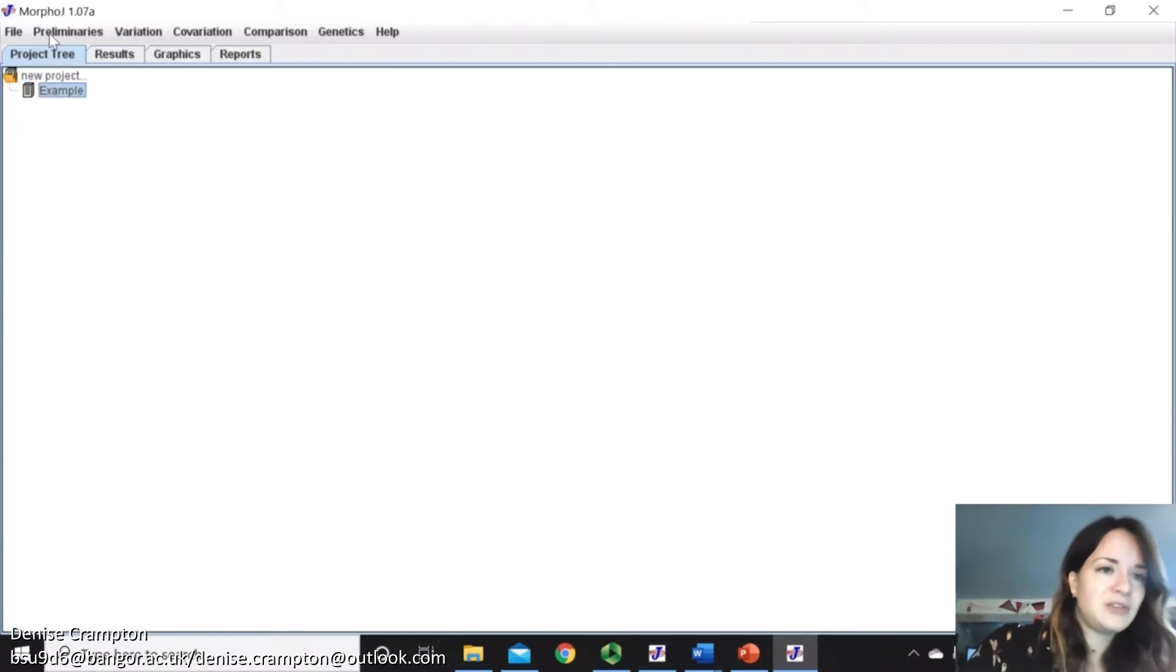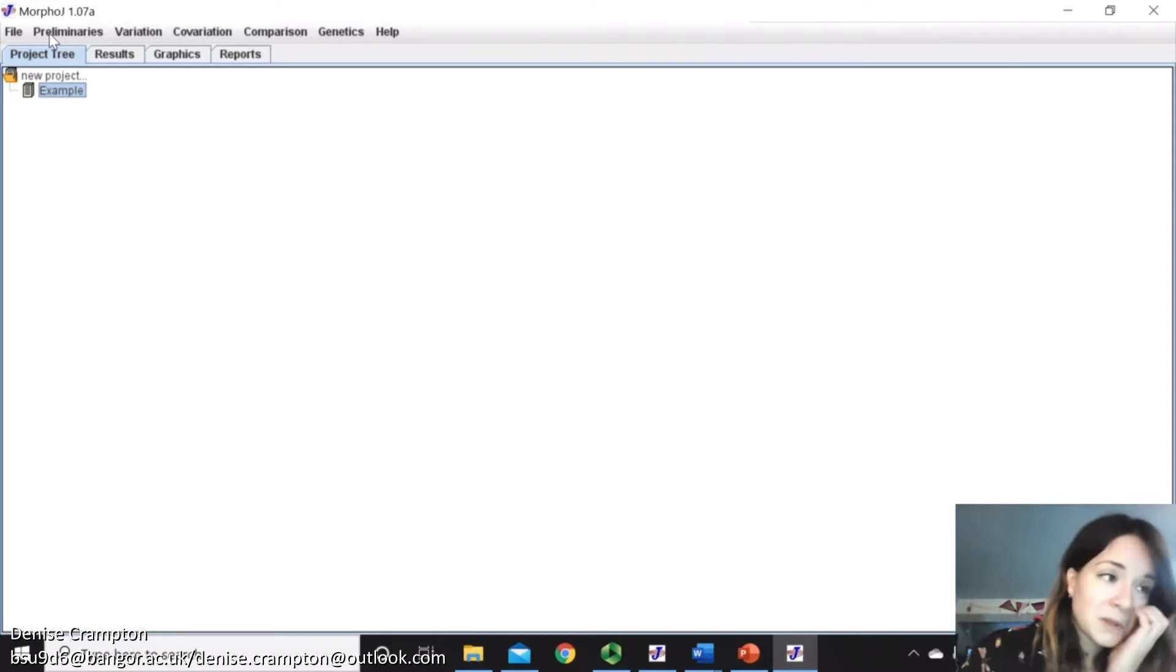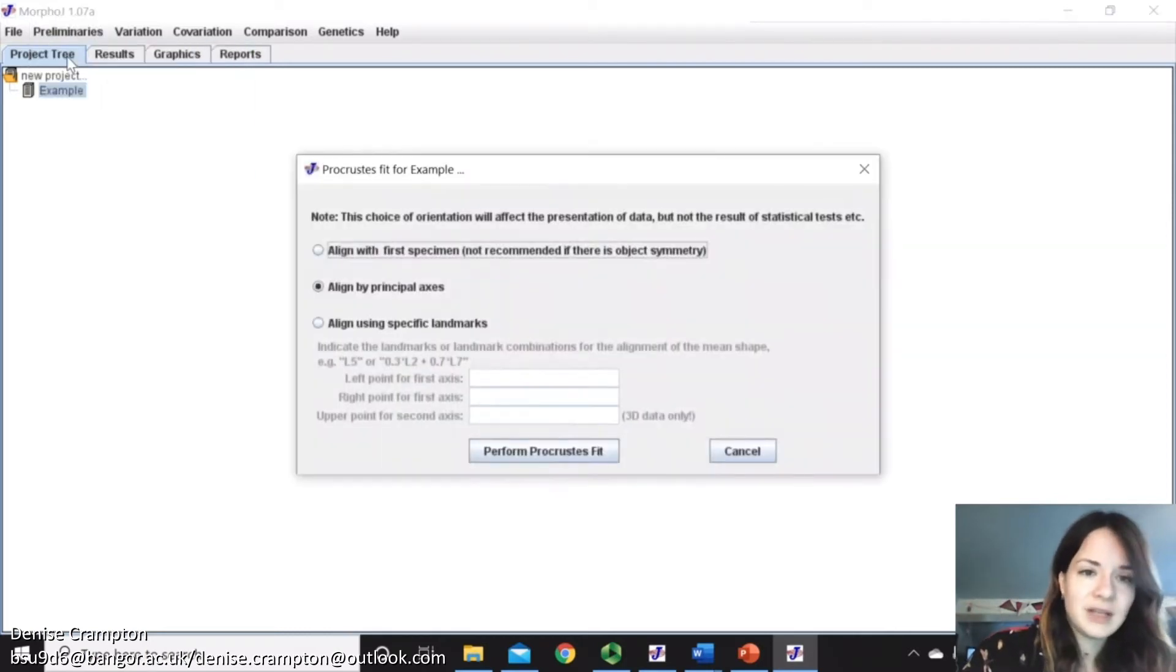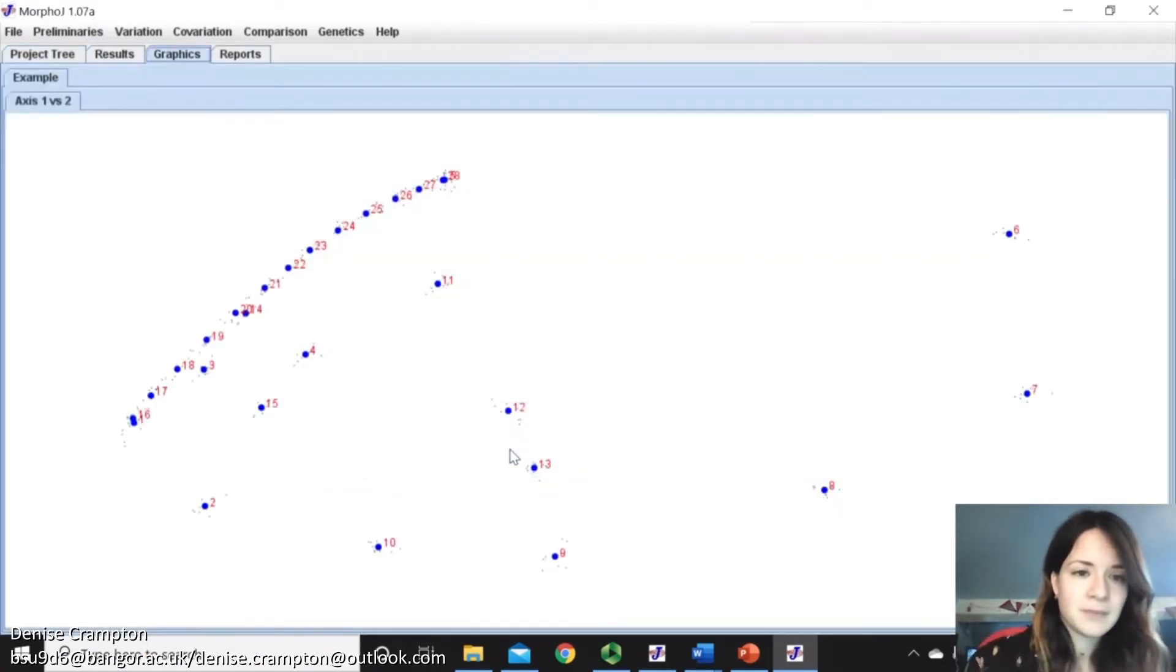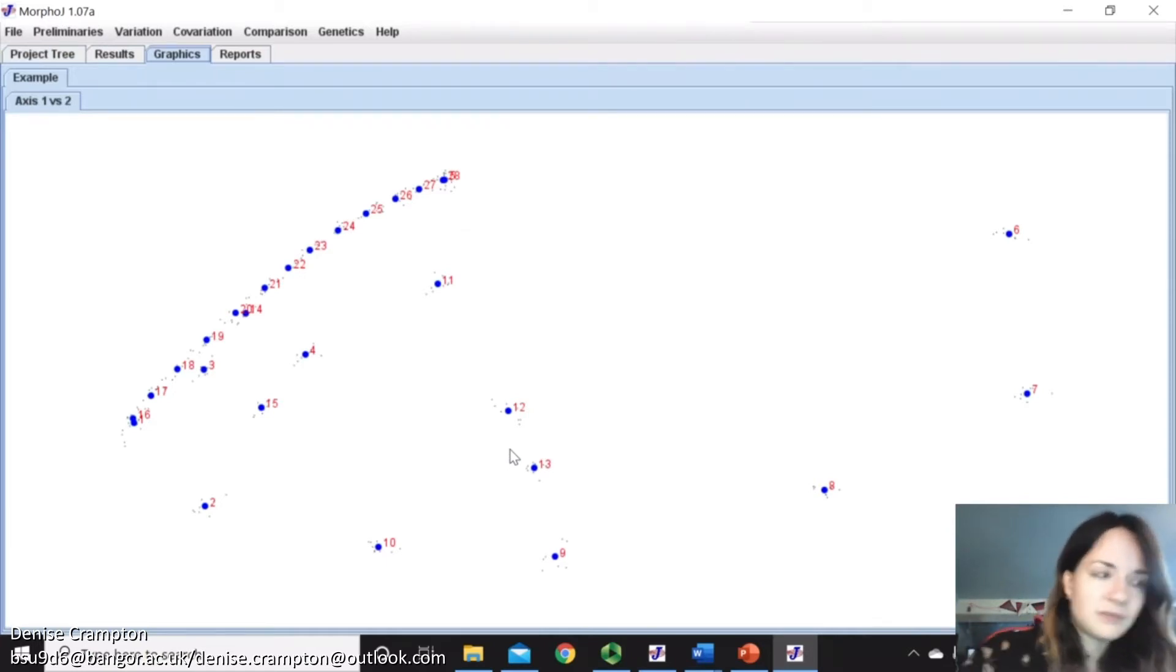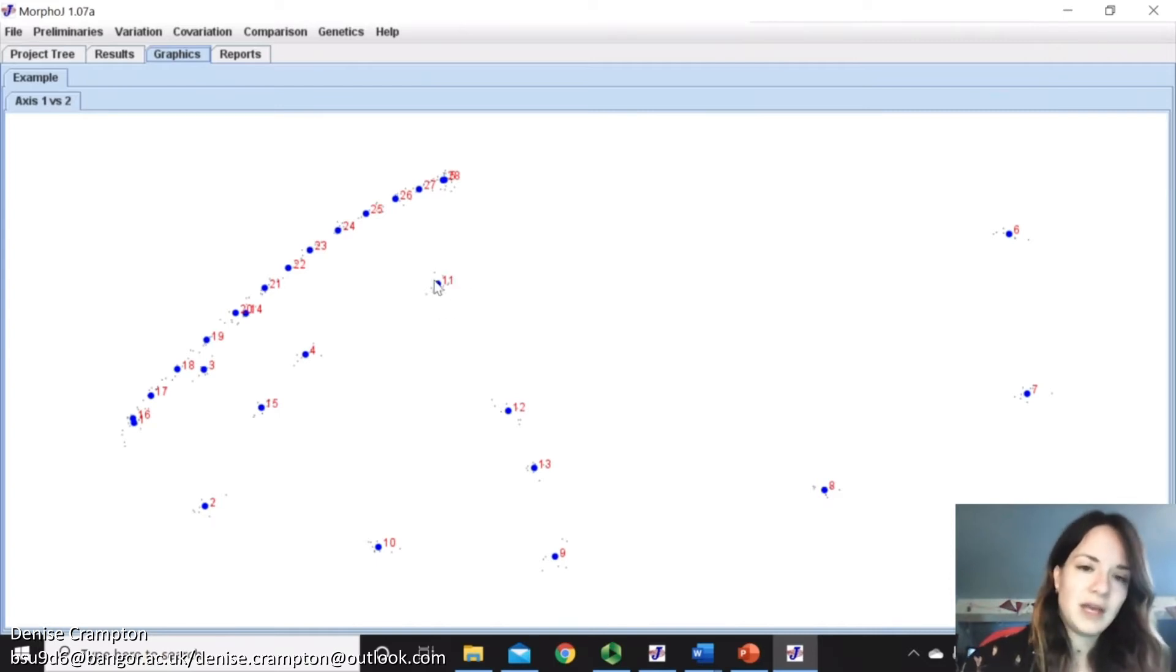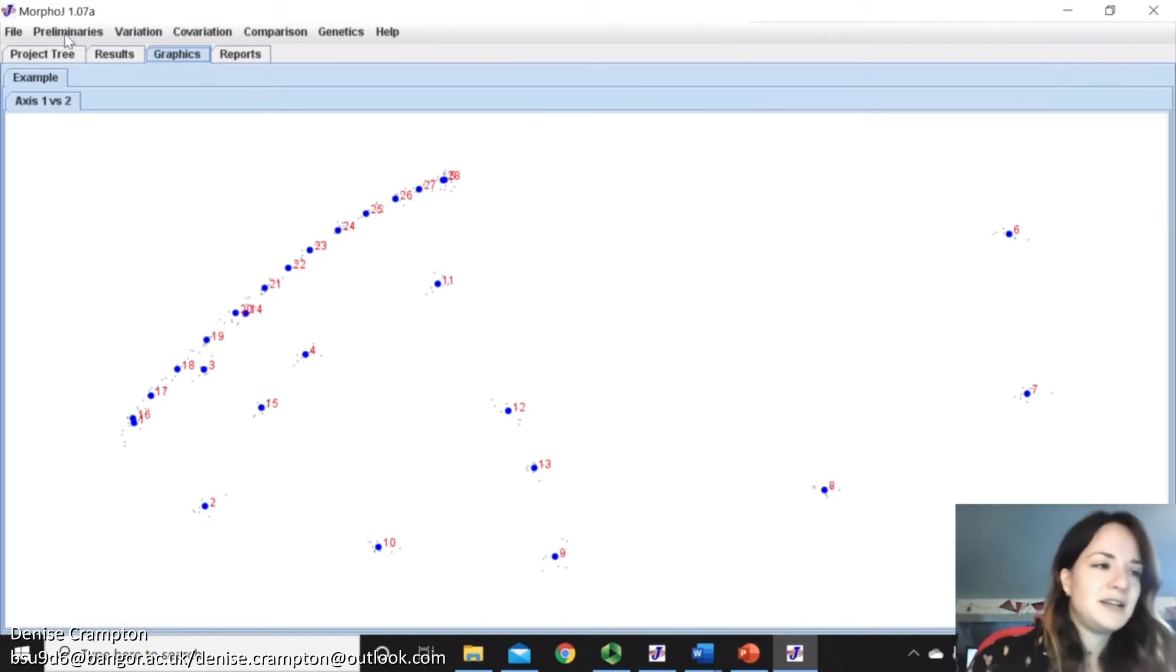So now you're going to do the Procrustes superimposition. So Preliminaries, New Procrustes Fit, Keep On Align By Principal Axis, and then Perform Procrustes Fit. So the large dots represent your mean landmark positions, and then the small dots represent your Procrustes residuals. So you can now check if there's any data outliers.